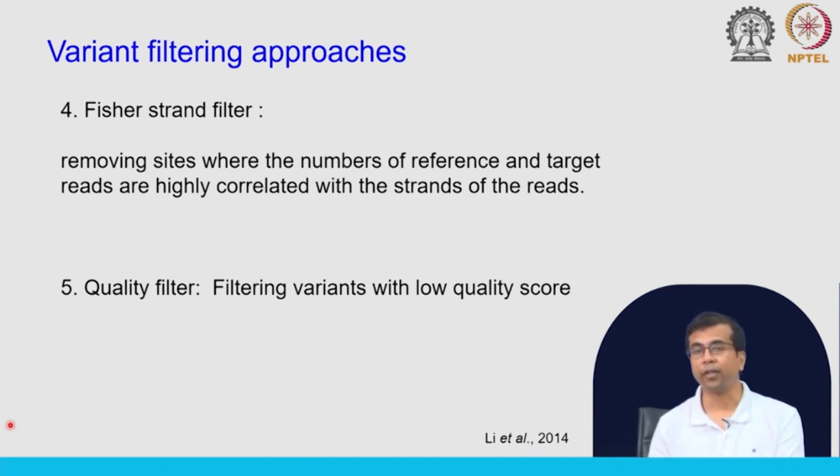Again, you can decide on the threshold for this filter, whether it is 10, 20, 30, etc. This is something that is up to you. If you want to be stringent, you set it probably at 30 or so.